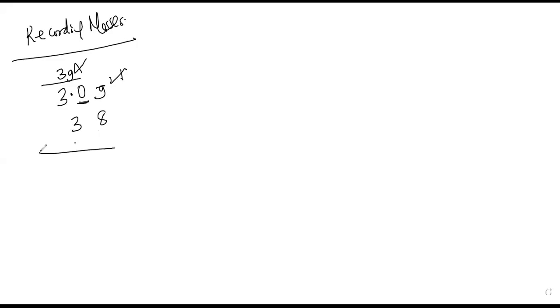The other thing on recording values of mass: the mass of the beaker should be correctly subtracted from the mass of the beaker plus the solid sample to give the mass of the solid sample. You have to take into consideration the empty container where you added the substance. Some use filter papers. So to get the mass of the substance, you have to subtract very well.